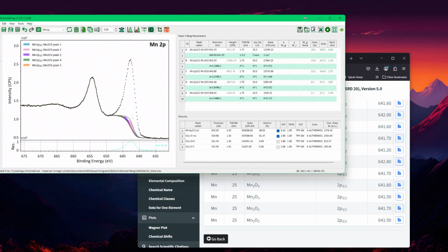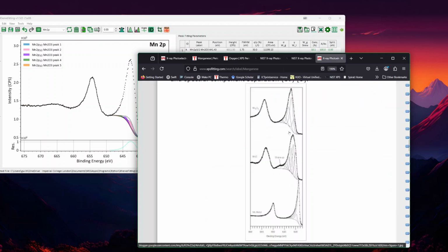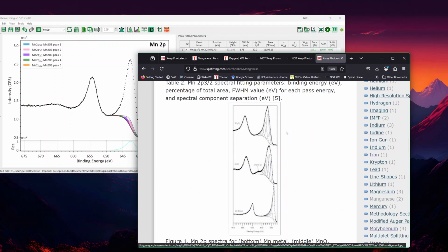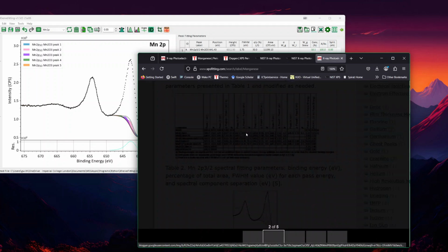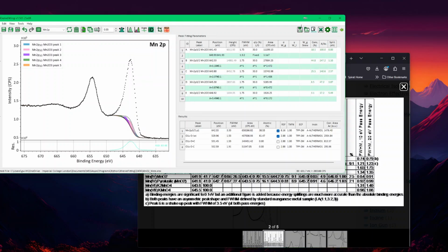So that would be, and for now I will leave it like this, that would be the one, if I go in here, that would be the one providing those peaks. And they are somewhere in this page, all these peak tables. So if you click on it, you get the numbers, and this was recorded as a peak library. So now let's just move the peak. To move the peak, by the way, you have to be on it. If I type on tab, you cannot move it in there.